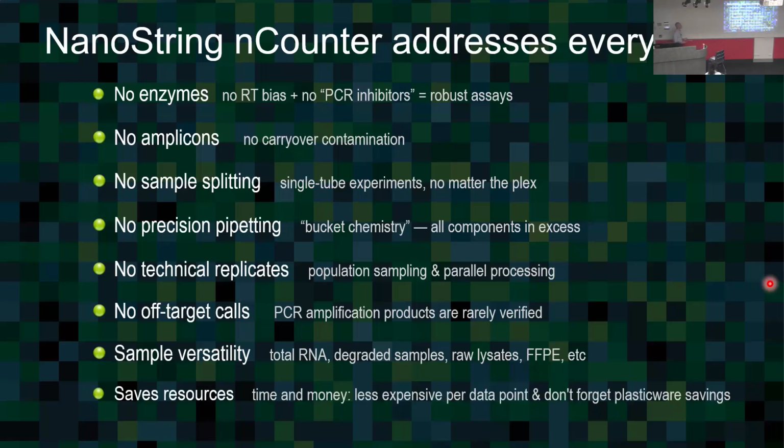So back in the day, I'll give you my worst example. I used to work a lot with PCR. I did my first experiments with a Cetus instrument at Oak Ridge National Labs in Tennessee with my first postdoc. That was like the first PCR machine. So I remember all the crazy things. And I remember my worst ever sample was fungal spores. I could not amplify from fungal spores. Don't know what it was. Plants are not much better. There's polyphenolics and everything. We don't care. As long as what's in your reaction doesn't interfere with hybridization, there's no crazy salt thing happening in there, then all you need is a hybridization to happen with this technology.